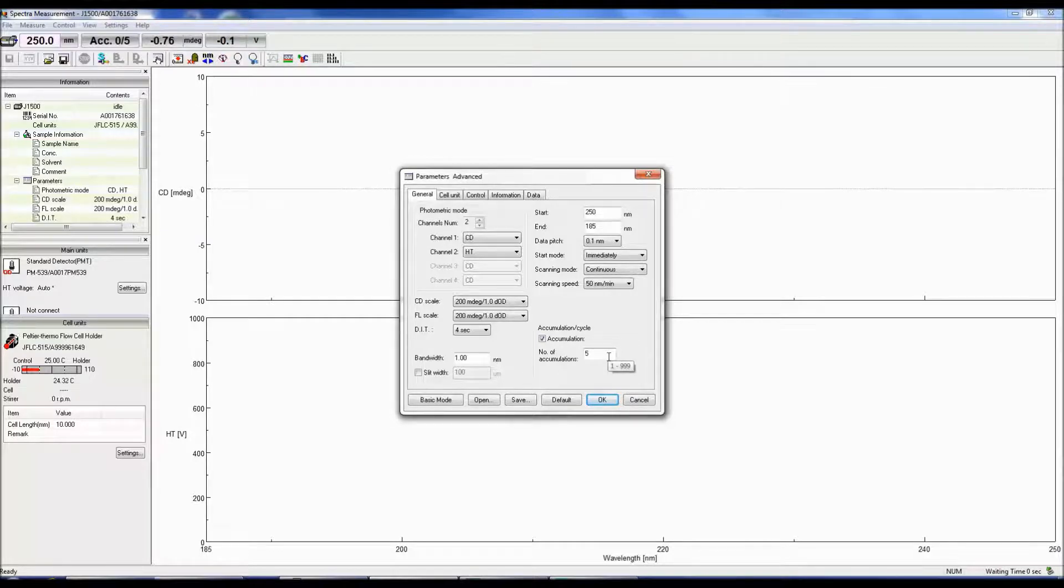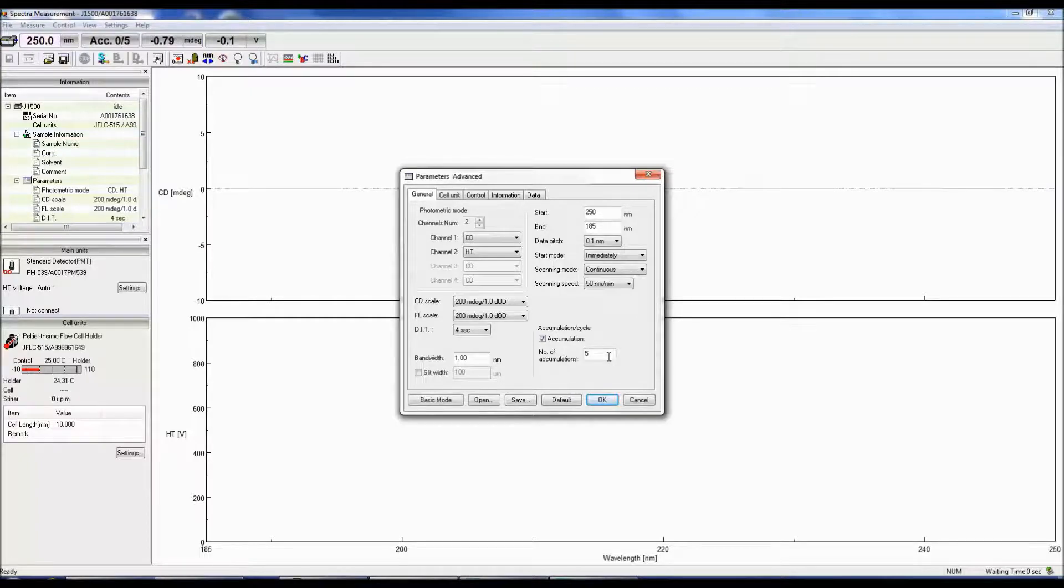The accumulations are the number of spectrum obtained and averaged together. The more accumulations, the better the signal to noise of your spectrum.